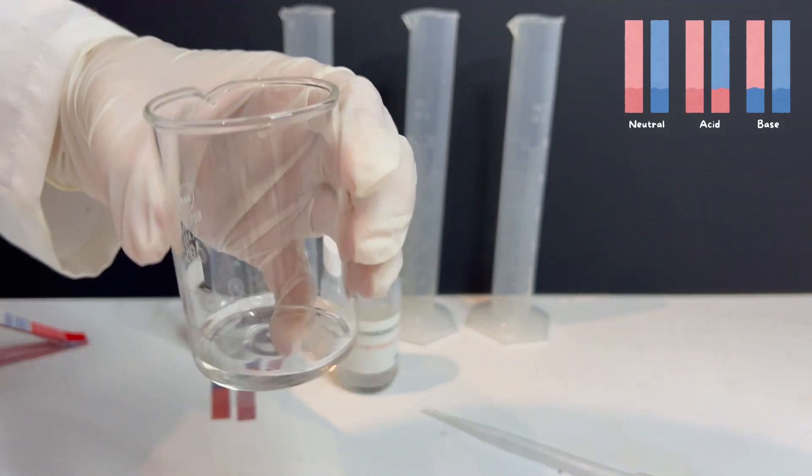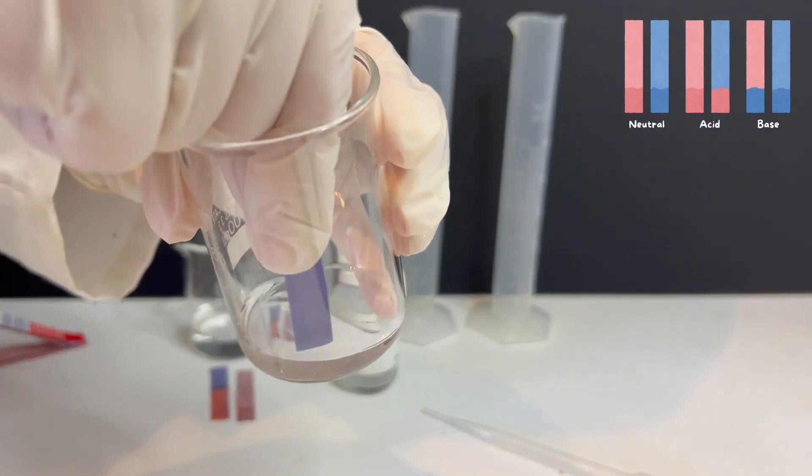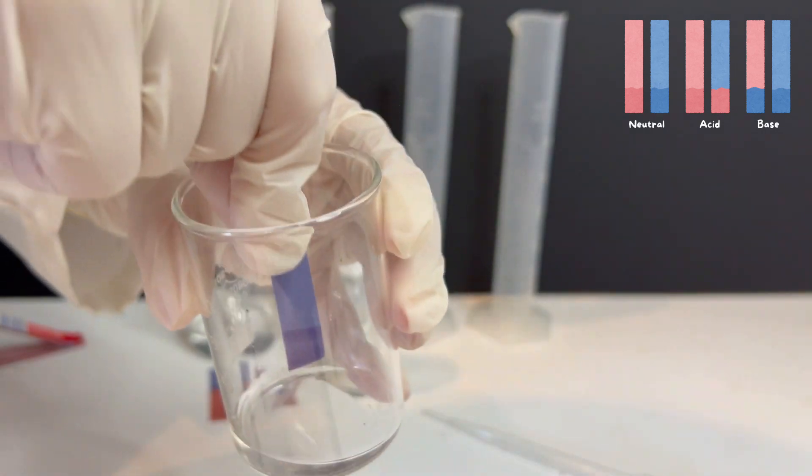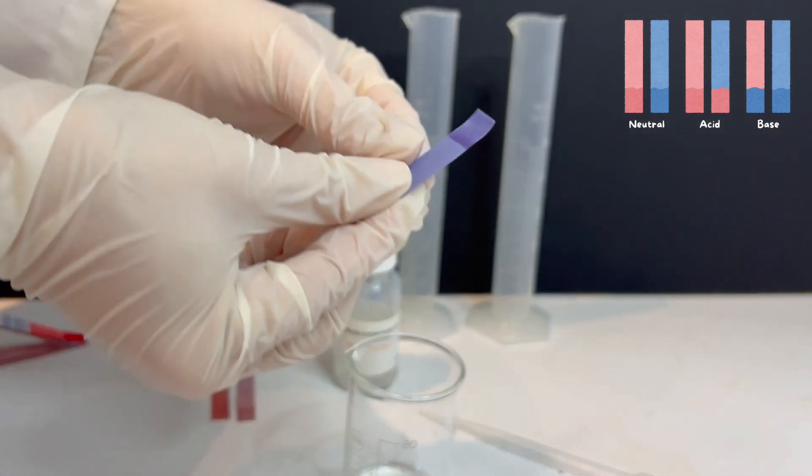I start by dipping the blue litmus paper into the sodium hydroxide solution. There is no real color change. It stays blue. This means the solution is not acidic.